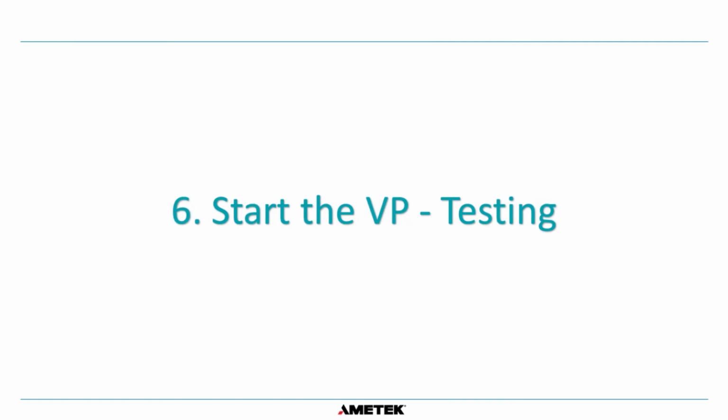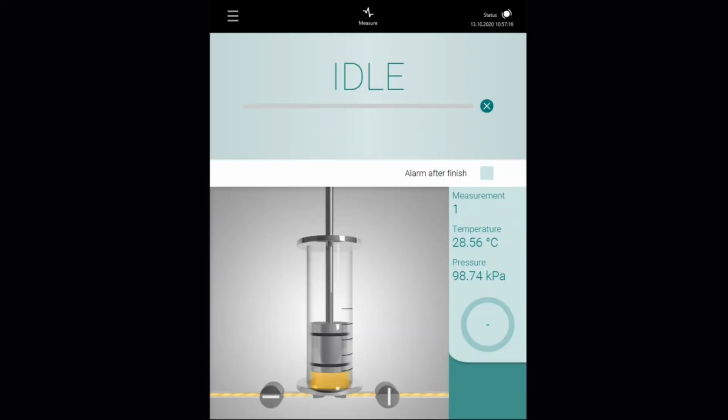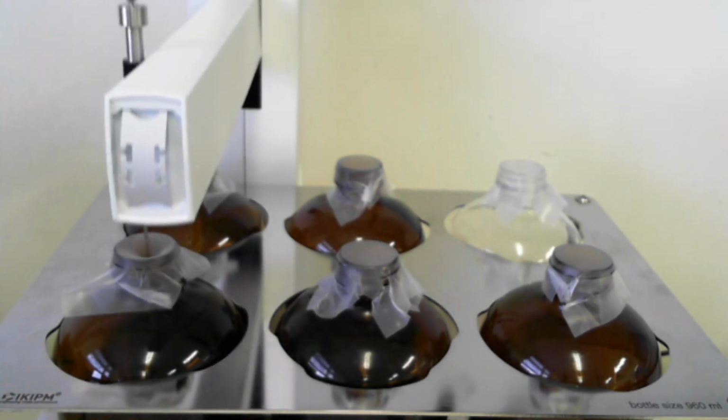Step 6. Start the measurement. As a last step remains only to press the start button on the instrument. Watch how the instrument gets ready and operates the autosampler according to your playlist.